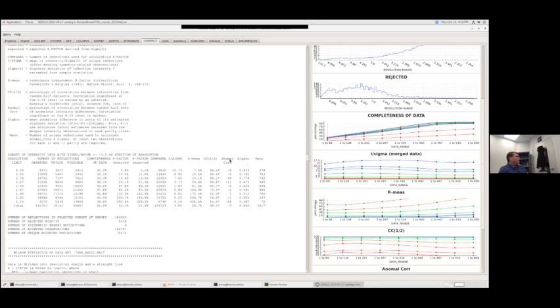And then anomalous correlation is if you're looking for anomalous signal. Here we turned Friedel equals true, so we shouldn't expect to see anything. But if we had it set to false and we were expecting to see anomalous signal, what you want to see is positive values for this anomalous correlation. And again, anything above 10% says that there might be a significant correlation and therefore useful anomalous data.